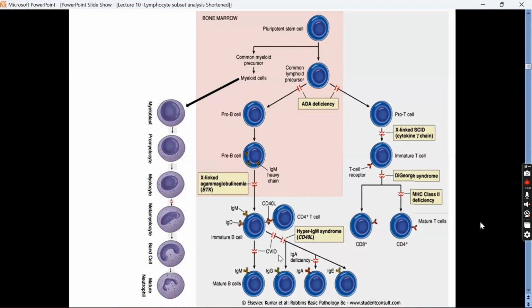So that is the expertise he had at that time. And then I understood why he asked for plasma cells. Because there's a class switching defect, and only when the B cells go for class switching do they go on to become plasma cells, which are the terminally differentiated stage of B cells. So when there is CVID, the class switching does not happen and you don't get plasma cells. There are multiple types of CVID, but this is a differentiation if class switching is the problem. So that is the reason why he asked. When a patient has CVID, he has a humoral deficiency. Humoral deficiency means antibody deficiency, and these patients are prone to giardiasis. So that is how you should see pathology.